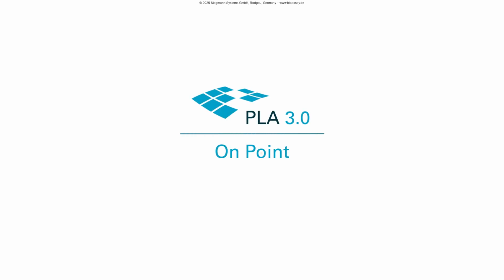PLA On Point. In this video, I show how to request and provide a reason for change in PLA 3.0. In a GMP-compliant environment, I may want to log specific changes to a document.